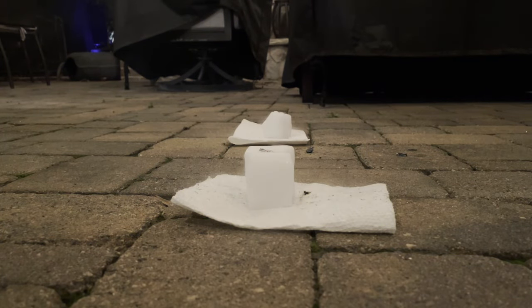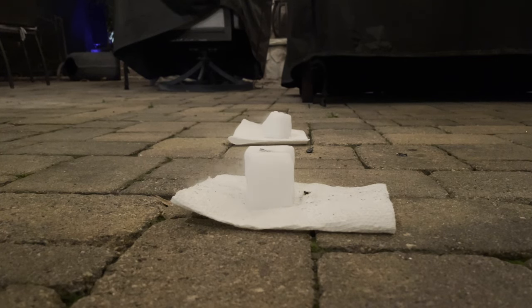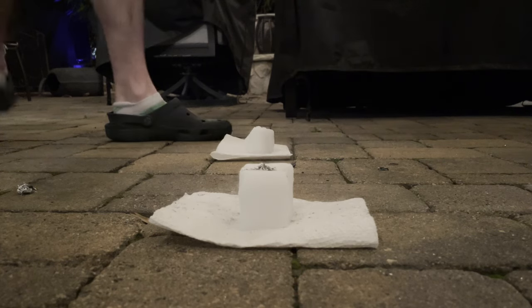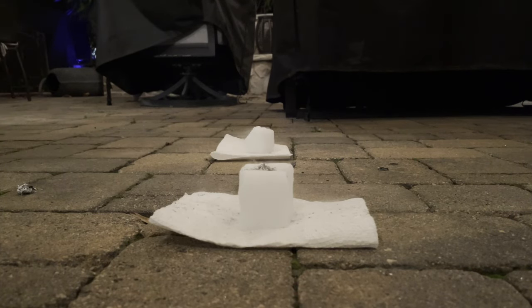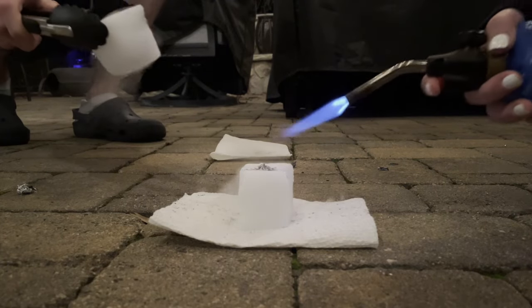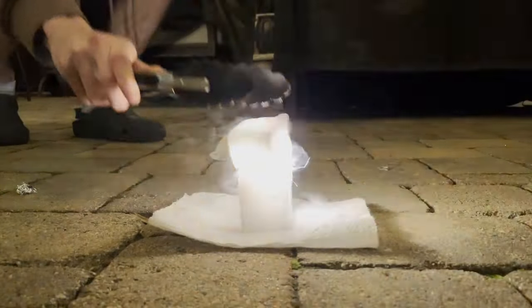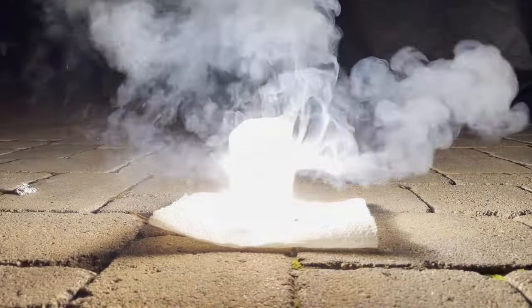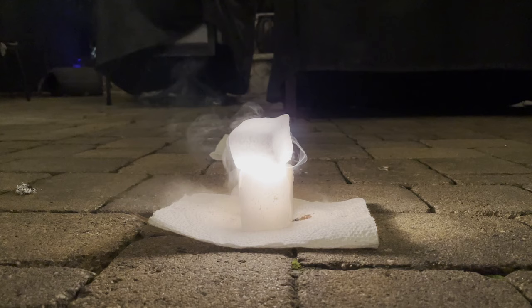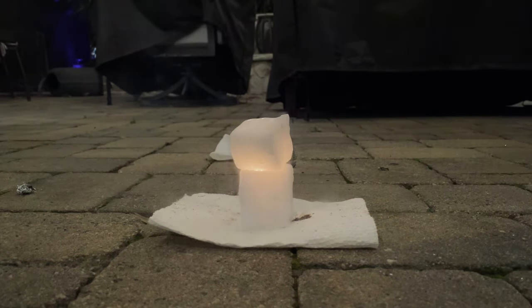The reaction is clearly accelerated by the dry ice and burns very hot and very bright. So now we're going to do the second part of this test, where we put a piece of dry ice on top of the reaction to fully enclose it in dry ice and hopefully get a bigger reaction. That was definitely a stronger reaction.